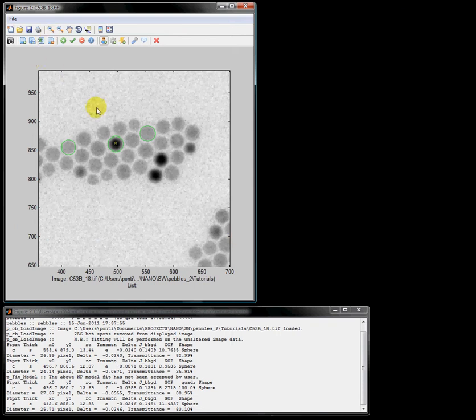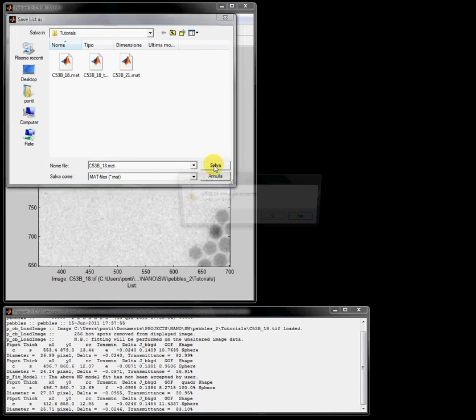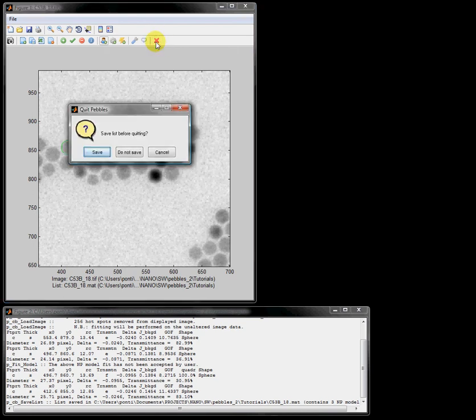Now I want to save my results. You can save all nanoparticle models in a list file — just press the save list button and save it to a file. That's enough for the first tutorial. Finally, I'll show you how to close Pebbles by clicking on the red cross quit button. In the next tutorial I'll show you how to use the semi-automatic mode to fit nanoparticles.